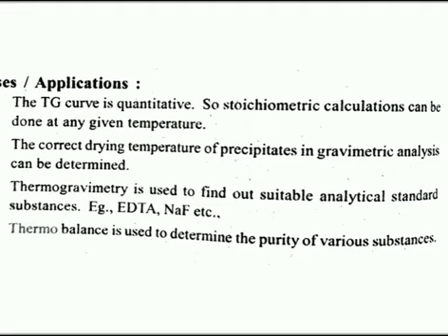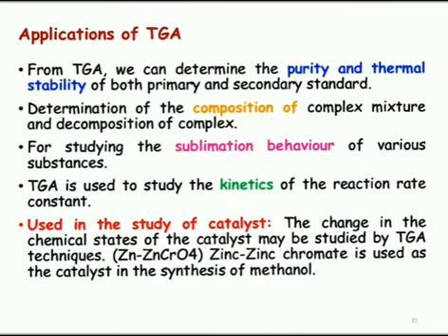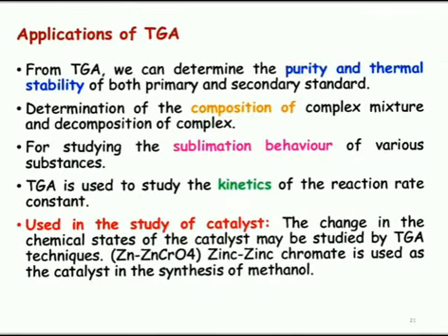And the thermobalance is used to determine the purity of various substances. So TGA is also used to determine the purity of various substances. We shall now discuss some other applications of TGA.